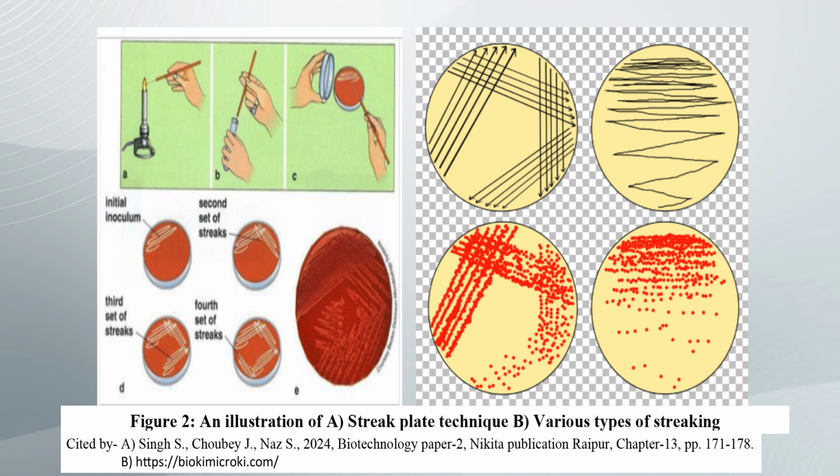It can be described as a rapid qualitative isolation technique. The main aim of isolation is to obtain a reduced number of colonies. In this technique, a loopful of culture is spread on an agar plate to get individual cells far enough apart from each other. The streaking method gradually dilutes the inoculum such that the bacterial cells can be counted as colony forming units.